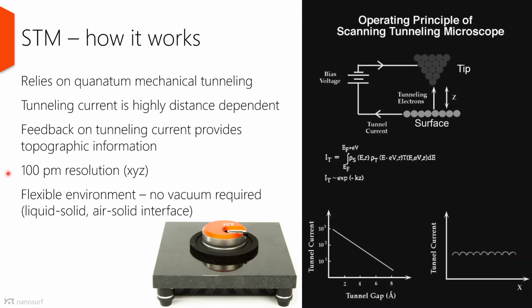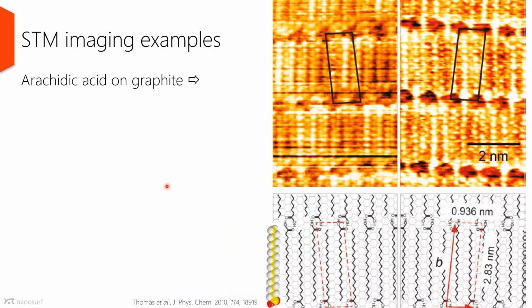The resolution one can achieve this way is around 100 picometers, or even better. STM as such is a very flexible technique, so it's very flexible towards the environment, so no vacuum is needed. Let me show you two examples of the power of STM.